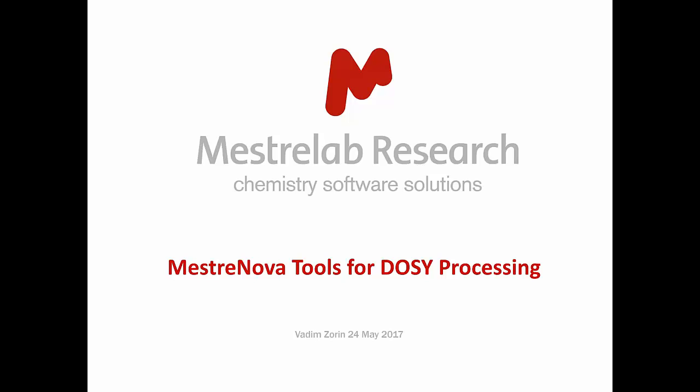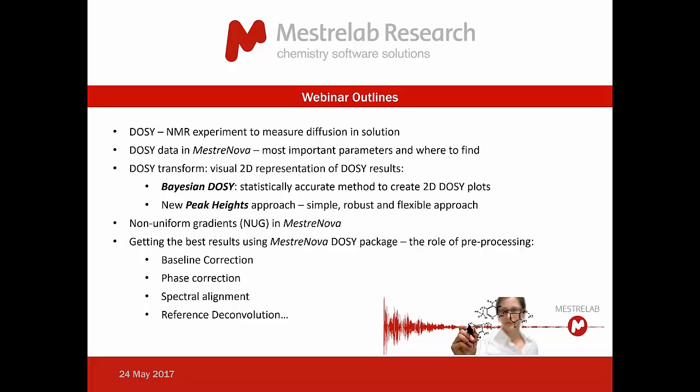I will start with a very short introduction of the DOSY experiment itself. Of course, here at MestReNova, we are specialists in processing data, not the experimental aspects of DOSY, so I'm not going to focus on that much. Please don't expect any complicated pulse sequences or complicated mathematics in this section. It's really a hand-waving way of introducing DOSY for those who probably haven't used it before and are interested to know a little bit more about this type of experiment.